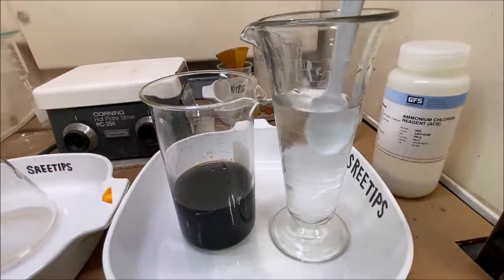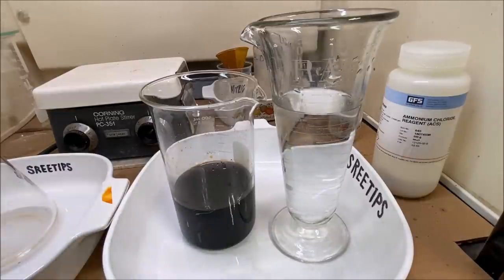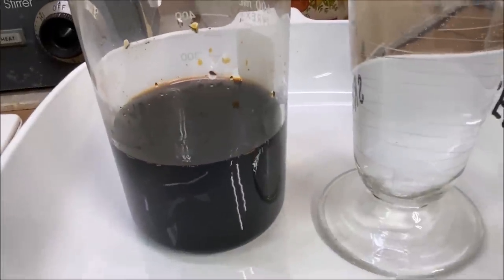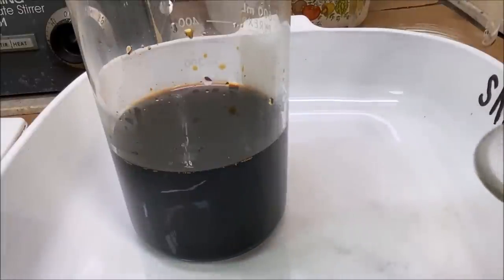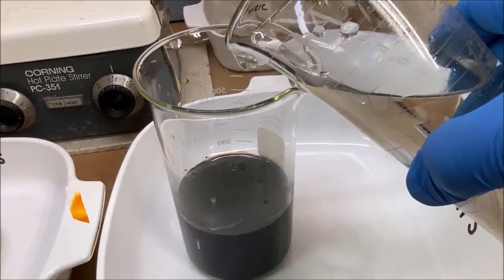And what we're going to do here, stir this up a little bit. What we're going to do is precipitate out our platinum. Here we go. We're going to add the saturated ammonium chloride solution to this platinum. Let's see what happens. We got to have it at the right concentration. If we get too concentrated, then we'll form this slush that has to be addressed. And if it's not concentrated enough, then the platinum won't come out of solution very well. Here we go. We're going to add the ammonium chloride right on in. Here we go.